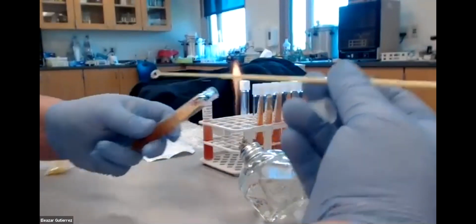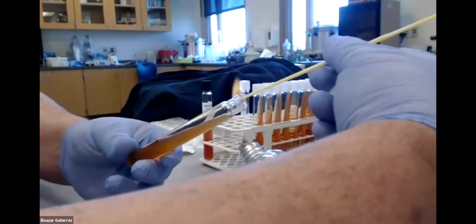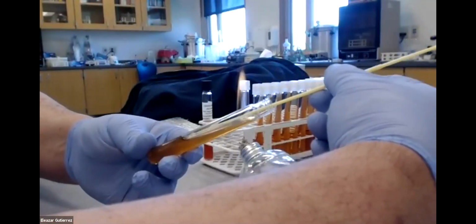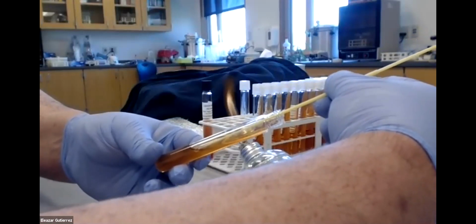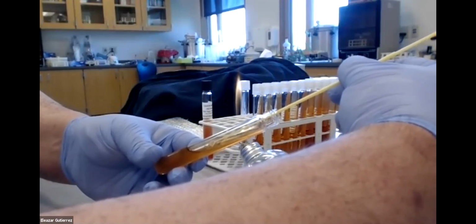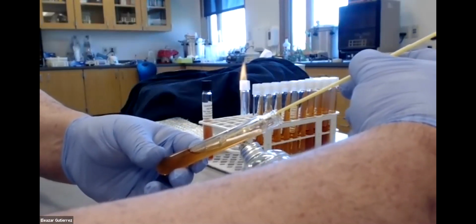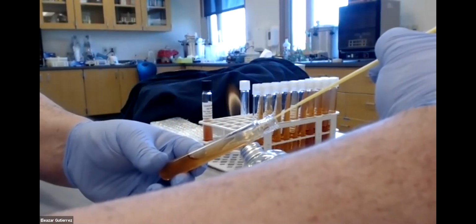1, 2, 3. I'm going to go down to the bottom, but I'm not going to pierce the media anymore. I'm going to go just to the bottom, just like that. And then I'm going to fishtail on the surface of the slant, just like that. Back and forth, back and forth. So this is the surface.